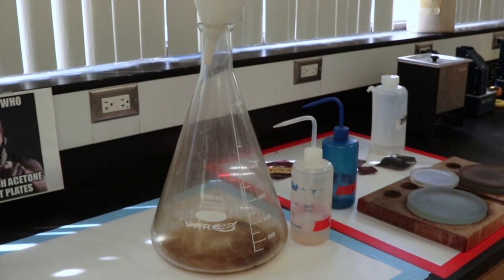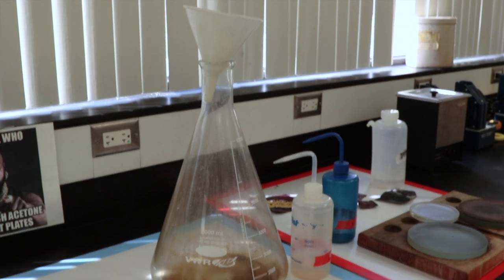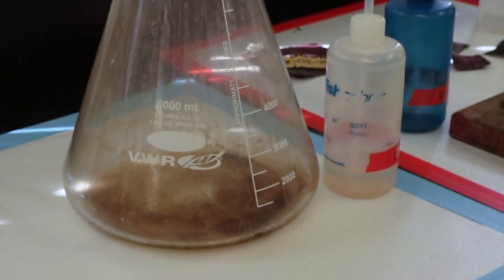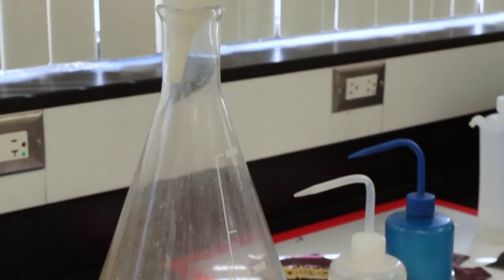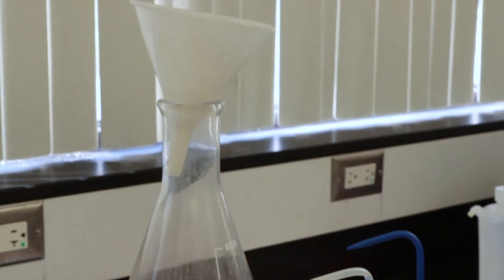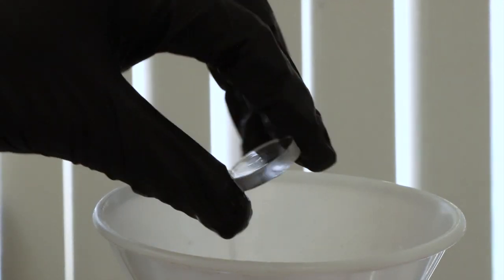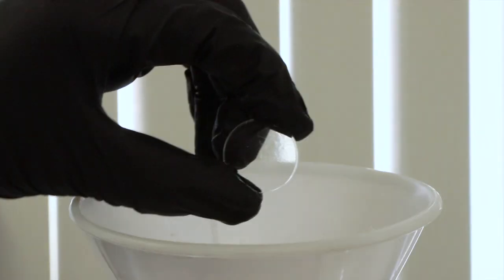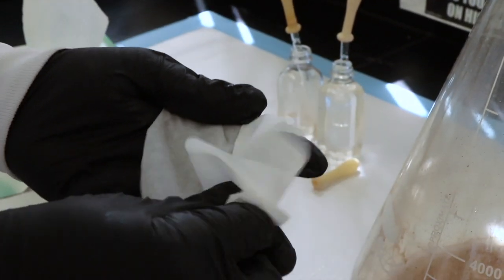To clean off the salt plates once we're done, we don't want to use water because that'll start to dissolve them. So we're going to rinse these salt plates with the product on them using acetone, and we'll rinse them off into this giant Erlenmeyer flask, which has a funnel on top of it. So I'll just quickly rinse both sides with that acetone, which should easily remove any organic product that would be left on them. Then I'll wipe them off real quick and place them back into the container for future use.